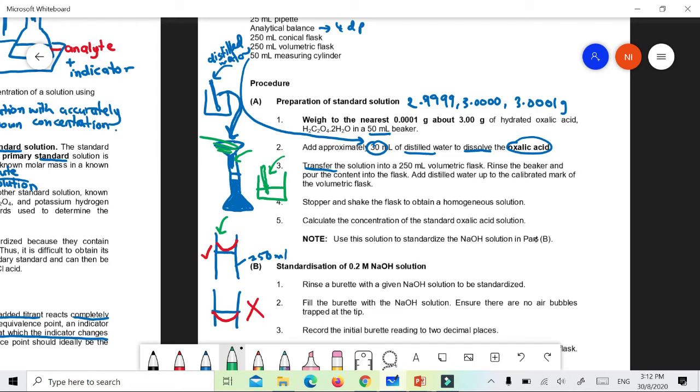Okay, you boleh tipu diri sendiri, tapi nanti result part B tak sama sebab you kira molarity, you kata volume dia 250, tapi sebenarnya volume yang you dapat kalau you terlebih itu bukan 250. Contoh dia macam ini. Ini graduated level. Atas lebih. Tak boleh. Nanti dalam kertas you buat macam ni memang kena ulang balik. Repeat. So sebab tu saya kata you must be very careful.